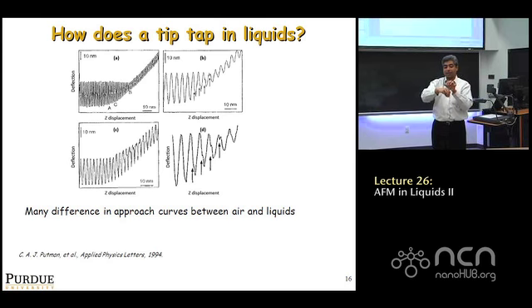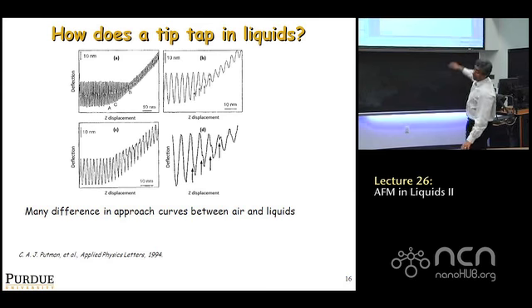Because you're shaking it with acoustic excitation, the base is shaking, you're still getting some residual bending motion, and the photodiode picks up the bending rotation angle. From B on to the right is that motion, called residual motion. Even in magnetic excitation there's some residual motion, although in acoustic excitation it is a lot more. So the amplitude never goes to zero, even in full contact.